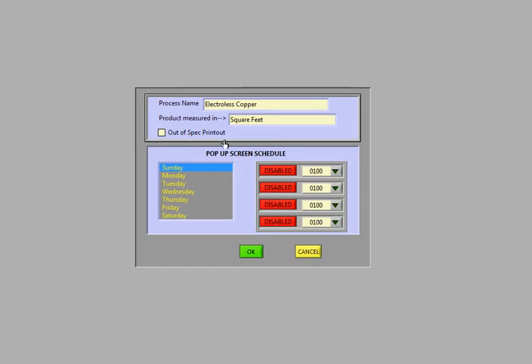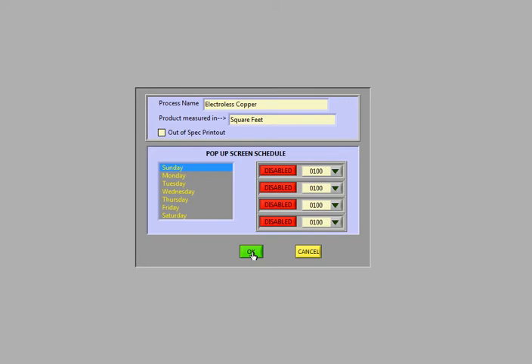And right here is where you set Sunday, Monday, Tuesday, Wednesday, Thursday. These are basically your shifts and the start times and stop times of your plating lines.